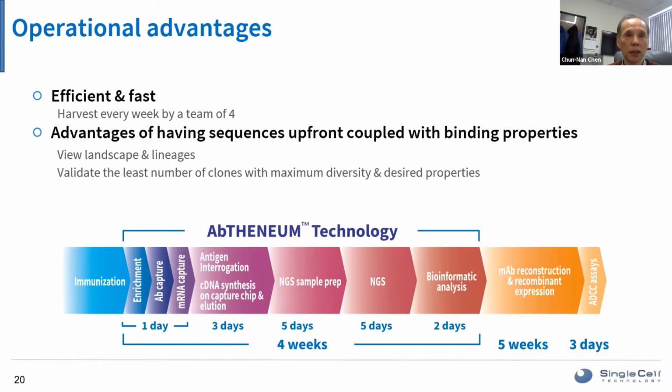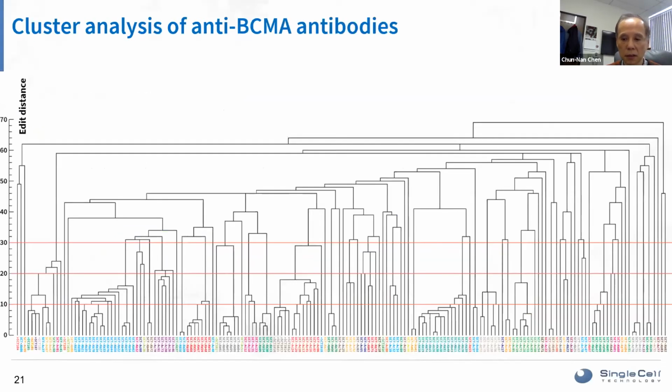The other thing, just to put another point, is that since you have the sequence and with a little bit of characterization, you can immediately file patents. If this is a fast race, then at least you can file patents on the composition of matter for this antibody sequence. So that's another advantage of having the sequences up front and being able to do it as part of the analysis. I think next are the studies.